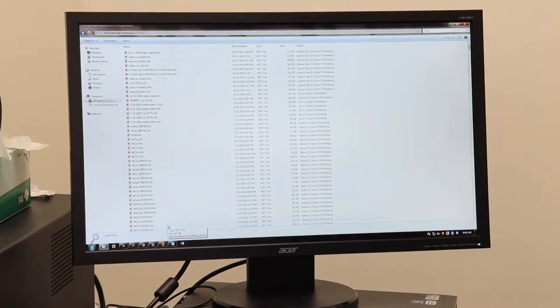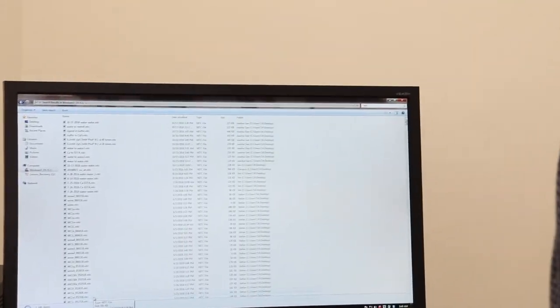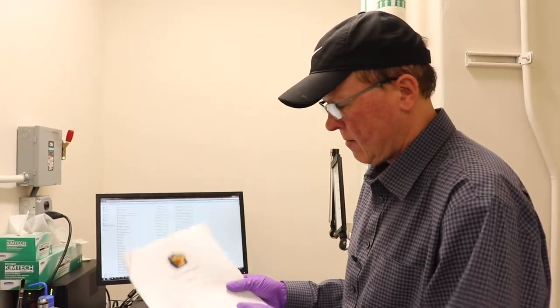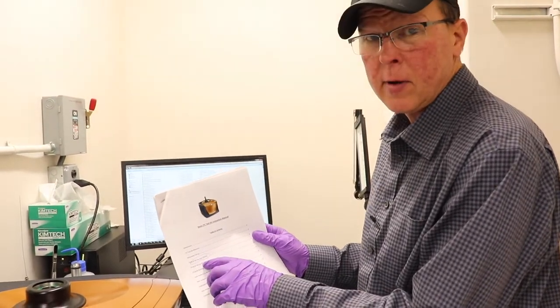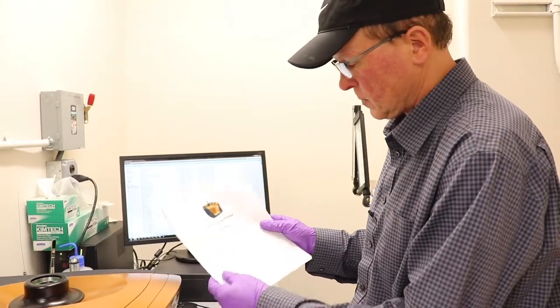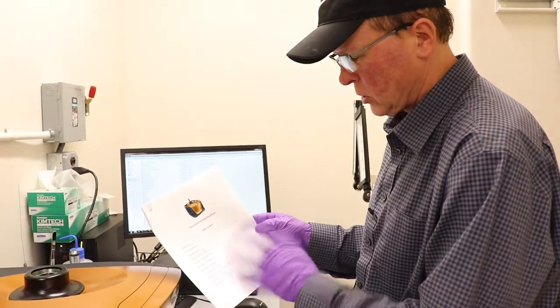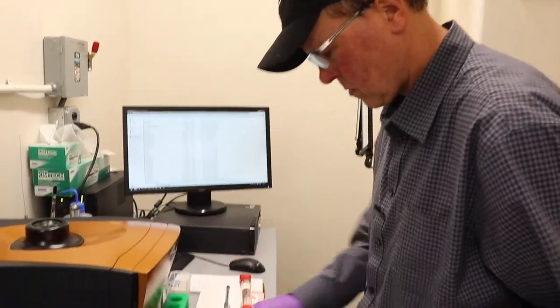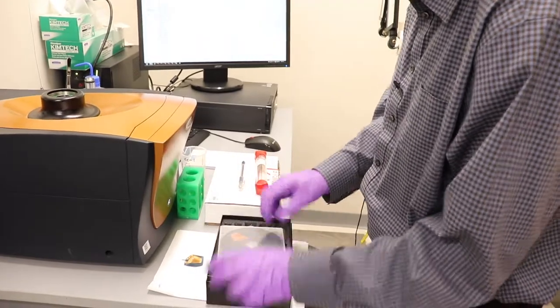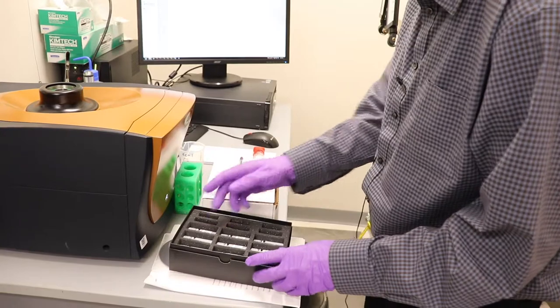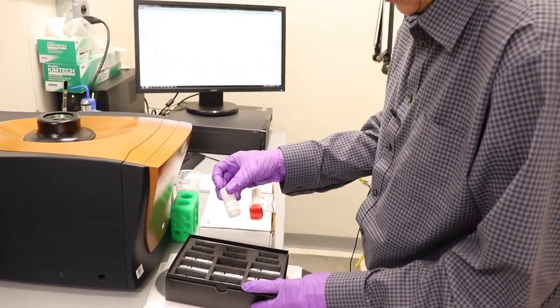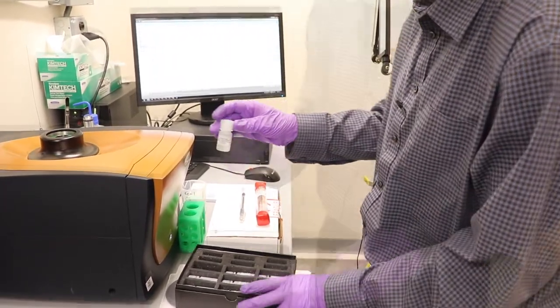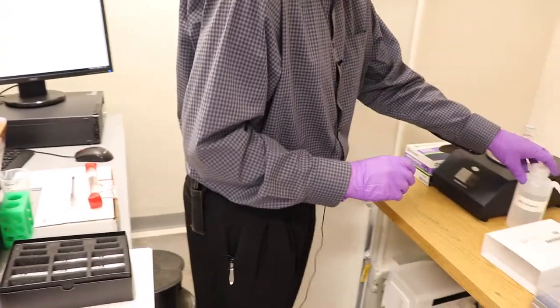Okay, so let's set up a basic water-to-water experiment. So first, I'm going to use the ITC test kit. When you're using this, you do want to be aware that the one manual is for both the low volume and the standard volume. This is the low volume. Just be aware of that. It's a little confusing sometimes where they switch back and forth between low and standard. So, the test kit. There's a CD I was talking about if you want to print out your own thing. So in here is the water, the EDTA solution, the calcium chloride. I'm just going to set up a water-water right now and we'll see how that goes. So I'm going to show you how to use the degasser.